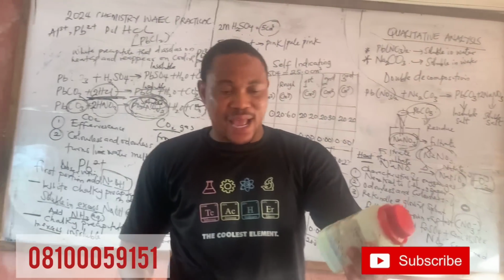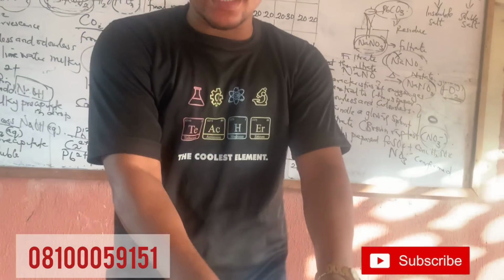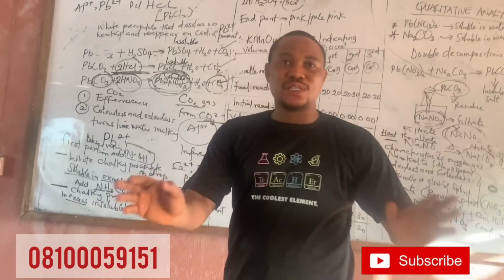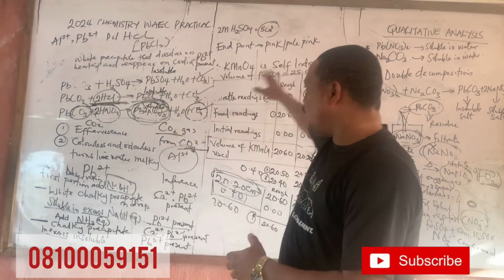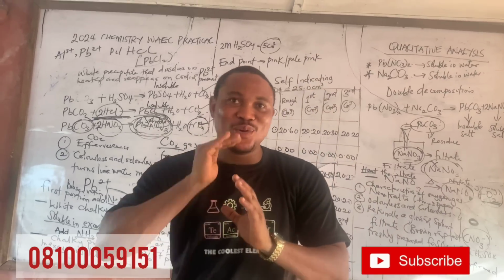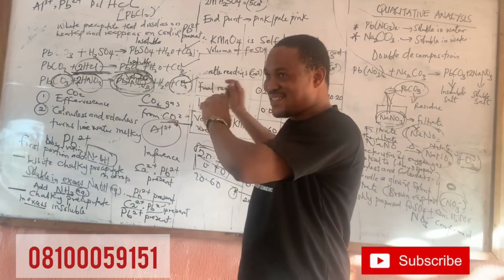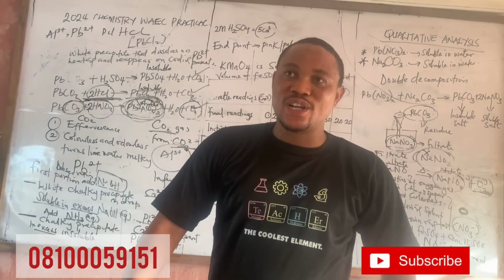I've told you I have my lead nitrate already. I have my sodium carbonate already. I would have done that, but I have to prepare the sodium hydroxide that I need, and I have to prepare the ammonia that I need for the test. You get that now? So we are going to carry that out, and the way I used to predict my questions, I'll give you sequentially what to expect. But this is 75% to 80% correct of what to expect from 2024.